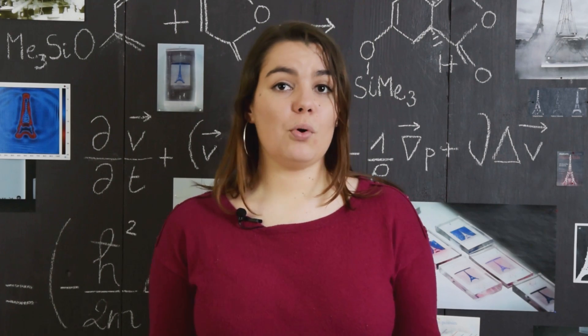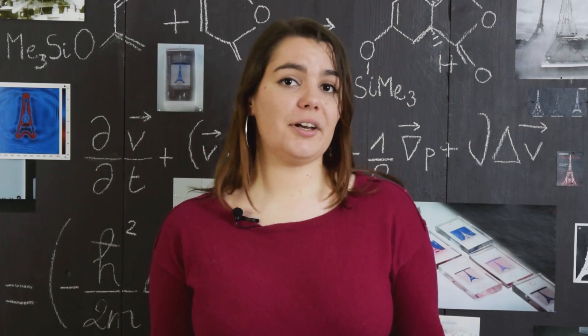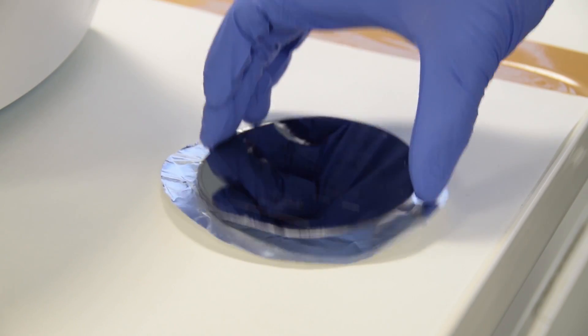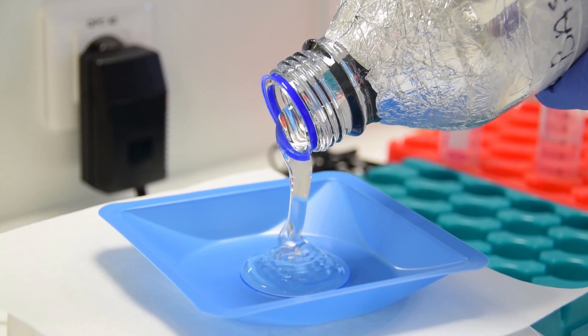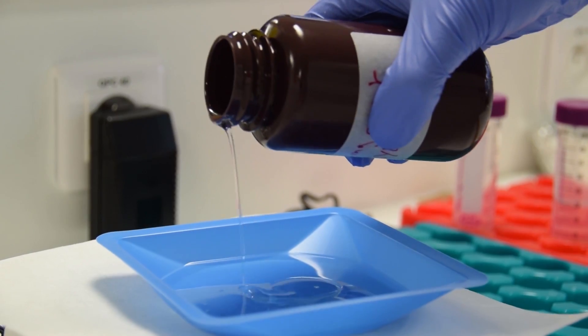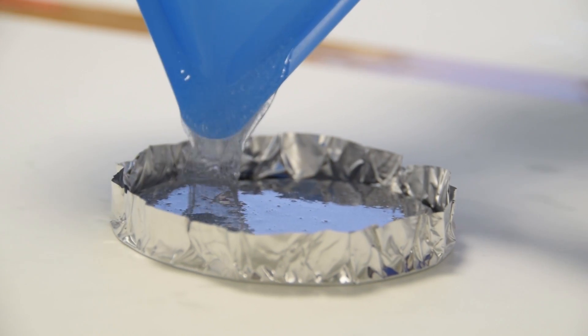So really, all that needs to be done is pouring it on the mold when it's liquid, then hardening it. And that's what we're going to do. We start by surrounding the mold with aluminum. We take liquid PDMS, then some cross-linker, mix them together and pour the mixture on the mold.